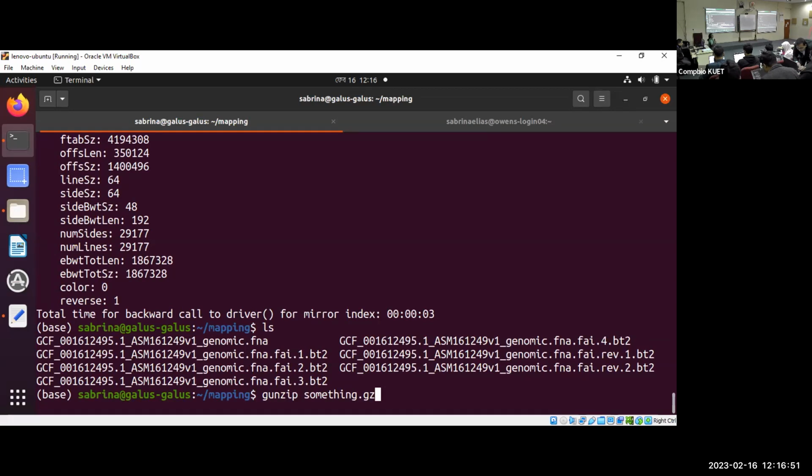So what we are now trying to do is mapping the two reads we generated, I mean the two paired end reads, with the reference genome. And for your information, this is for the E. coli reference genome, E. coli genome.